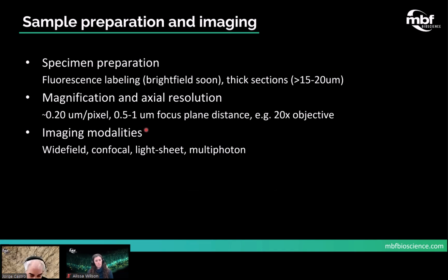And in terms of imaging modalities, we've been testing wide field and confocal images. Although we haven't really tested yet, I don't see why it should not work with other imaging modalities, like two-photon, other than the need for a relatively short distance between optical planes.